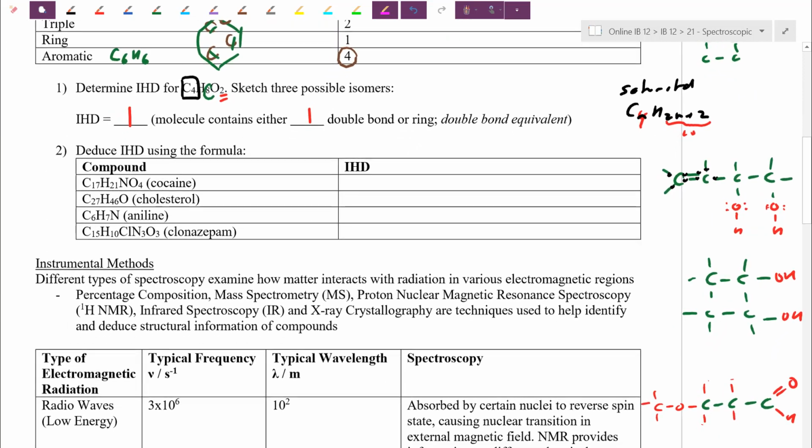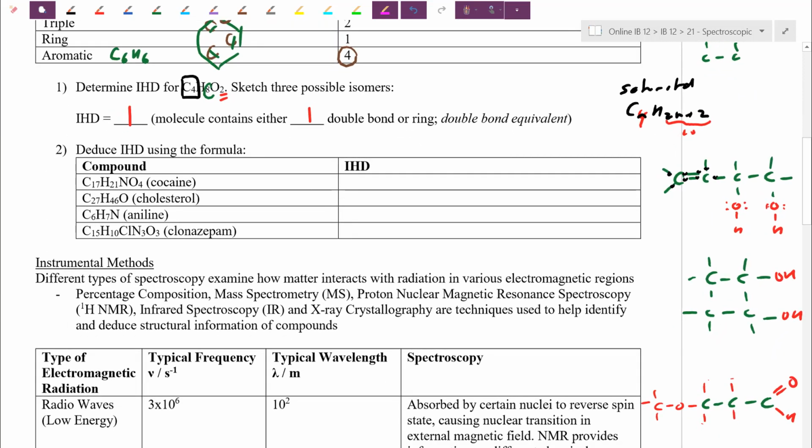Okay. So either with the formula, you'll probably need the formula for these compounds unless you look up the structures and actually draw it out for yourself. You can find the index of hydrogen deficiency. That is a double bond equivalent. Okay, so that's one hint we can use, no problem.